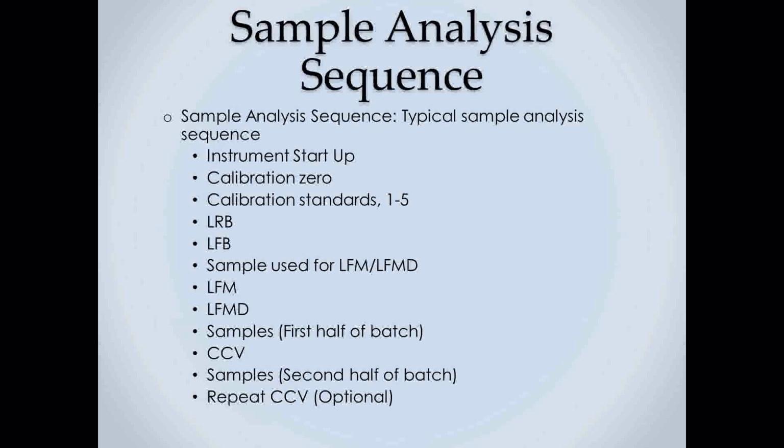So when the auditor or the laboratory QC person or the person running the laboratory training their staff, utilizing this method and this instrument, we've helped them at least say there's no question about what a batch is, and there's no question where the QC should be showing up, because there's no use running a batch down here if your QC fails or your calibration fails.